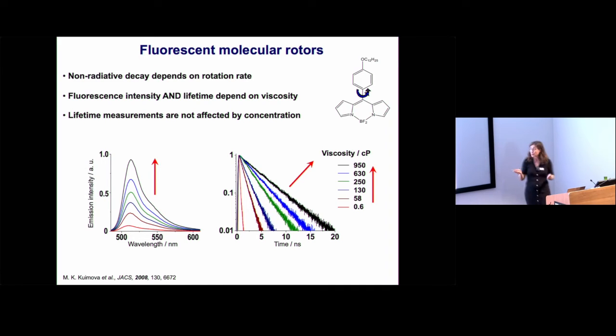So in our group, we really prefer to use methods based on fluorescence lifetime of our probes, because intensity, as you can imagine, depends on how much fluorophore you have in a particular part in the cell. And in a complex, heterogeneous environment of cells or biological molecules, you simply can't predict the uptake of your probe in any particular place of the organelle.